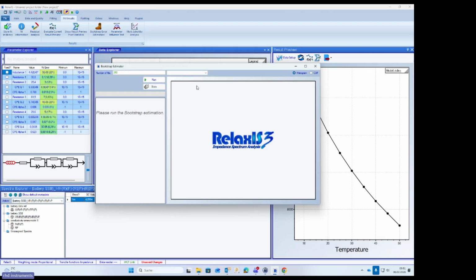So you might ask, okay, Marcel, you have performed now an autofit. But what would happen if I redo the autofit? Will I always end up with the same results? And the answer is no, because I have some kind of uncertainty for my fit parameters, which is here on the left side. You see this column called fit error, which is now in green, more or less. But you see some of them have a higher uncertainty, some have a lower uncertainty.